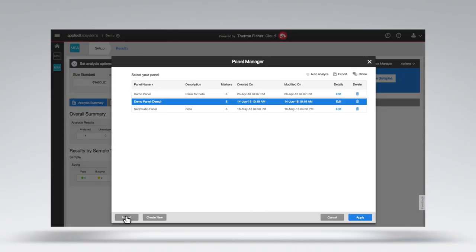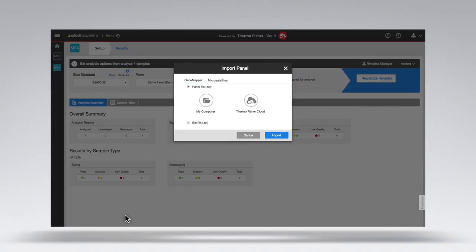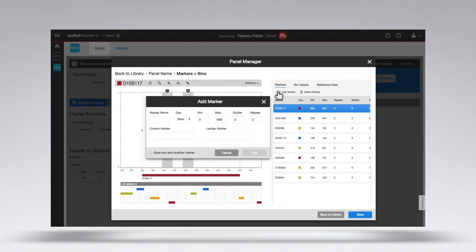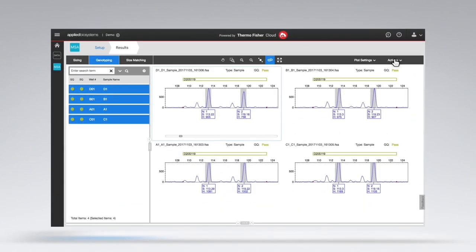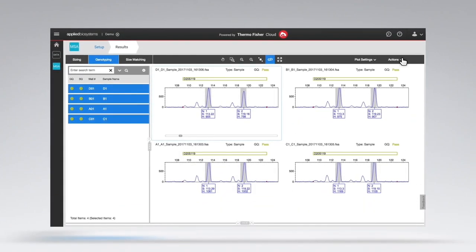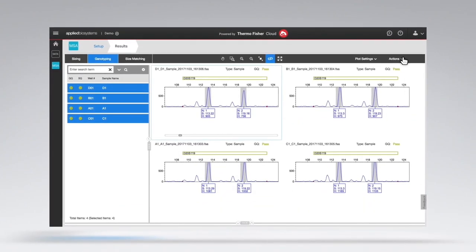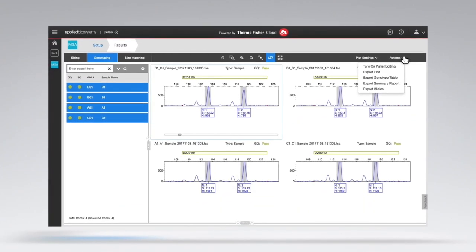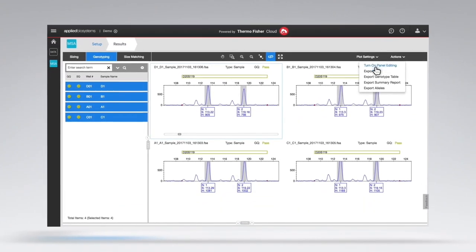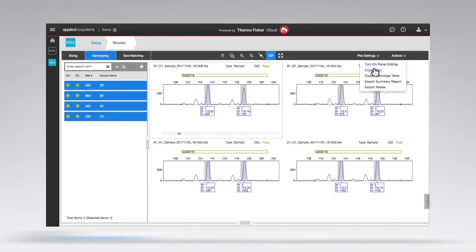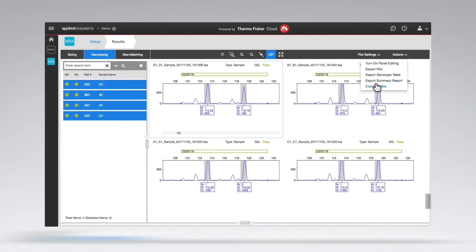You can easily create and import panels and bins from other projects or GeneMapper software. In addition, you can have access to flexible visualization options and layouts for exporting plots, alleles and your results.